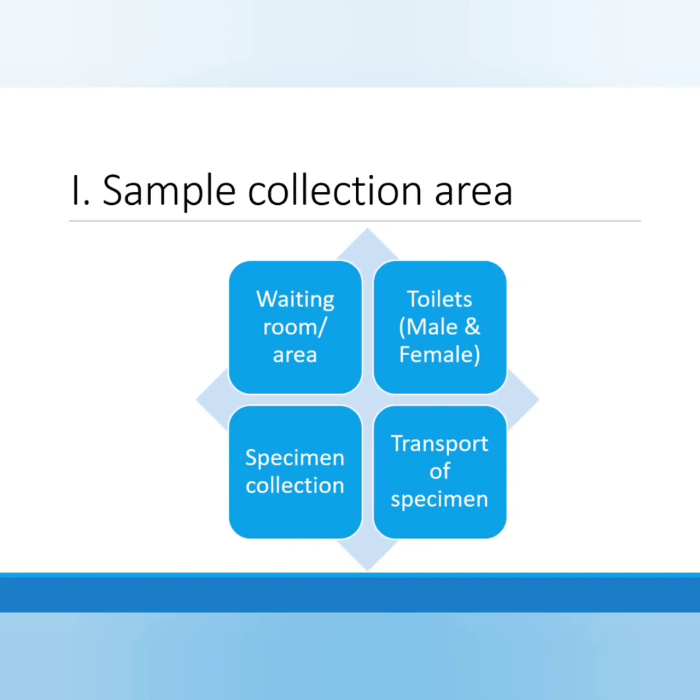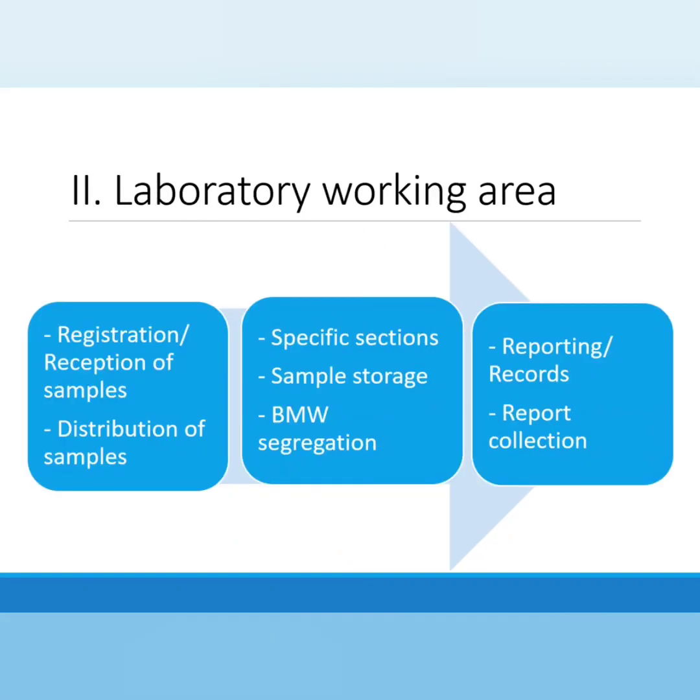A specific specimen collection area for phlebotomy, and an area to arrange and pack the specimens for transport to the different laboratories in case of a common specimen collection center.